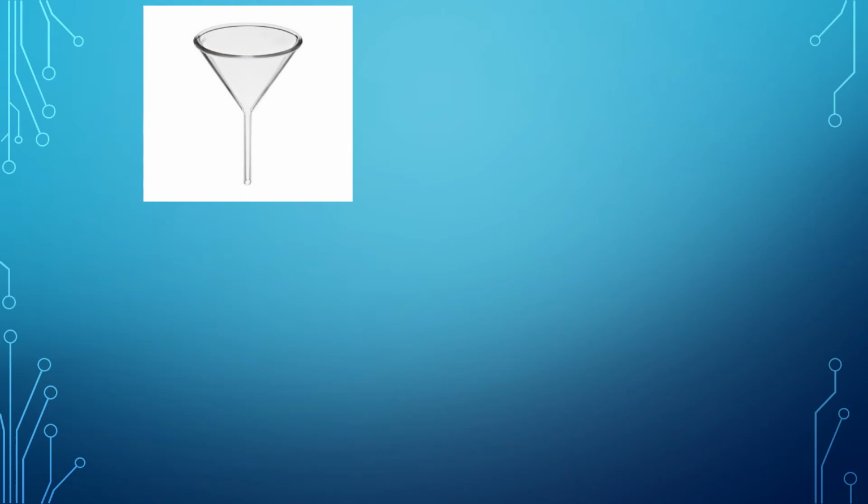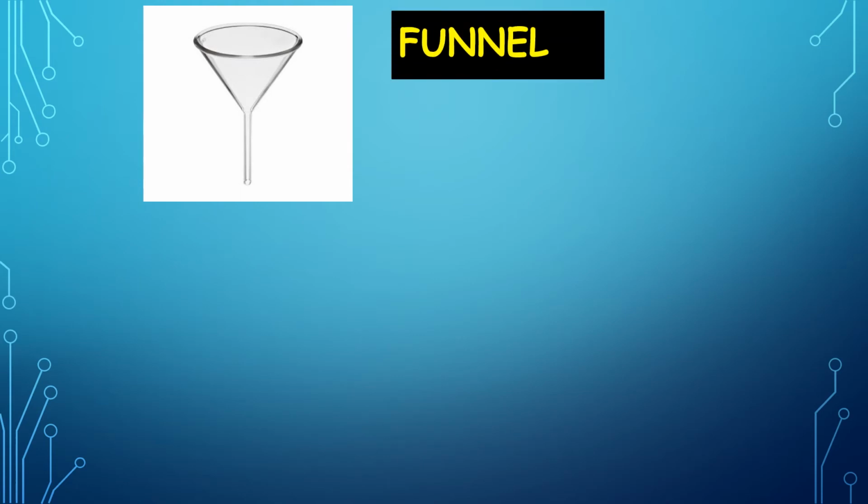So what about this one? What is the name? It is called funnel. What is the function? Holds filter paper for filtering solution. So when you're going to filter solution, you're going to use the filter paper and funnel. What is filter paper? Let us see.